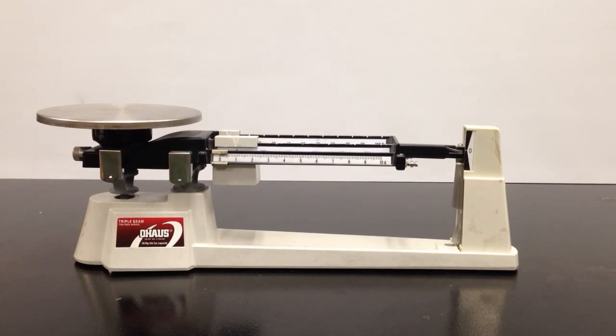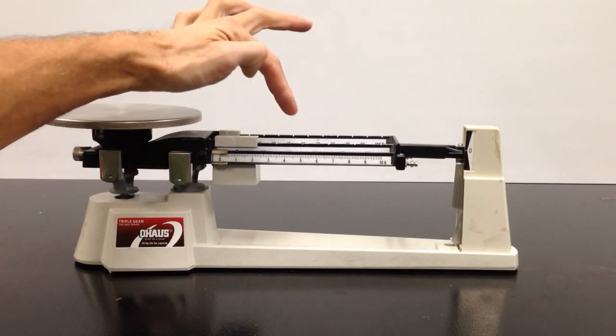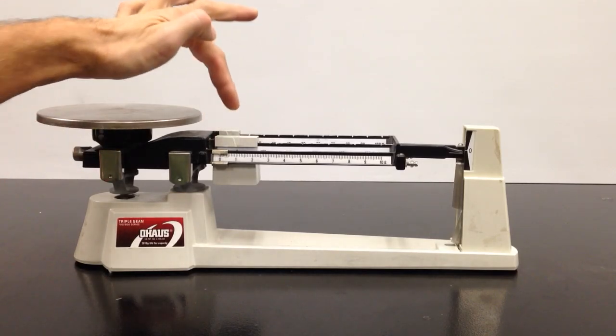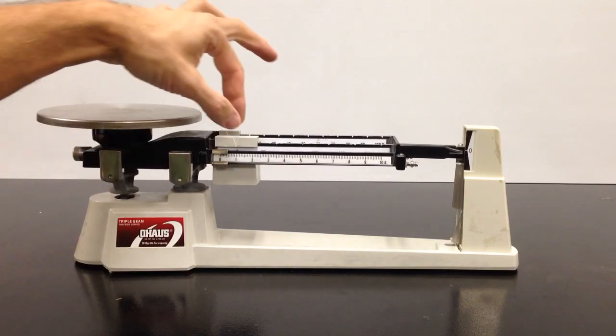Welcome to Super Simple Science. Let's look at the parts of a triple beam balance. It's called a triple beam balance because you have one, two, three beams, and on those beams sits one, two, three weights.